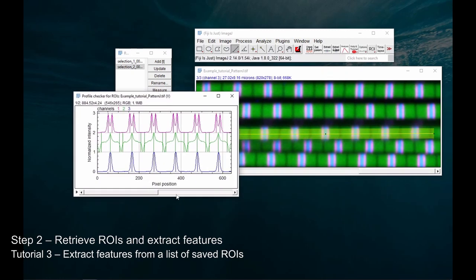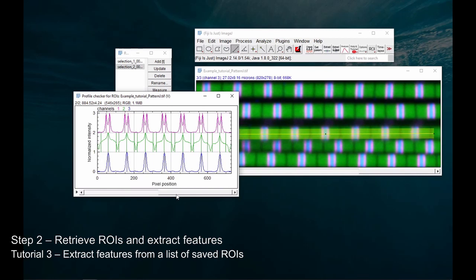At this point, you can analyze all the extracted positions, just like we did in the first tutorial, by pressing the Analysis button. If you were to do that just like I did in this tutorial, where results were already saved from the selections, you will duplicate the results. Therefore, use this tool only if the selections have not been used for extraction yet.